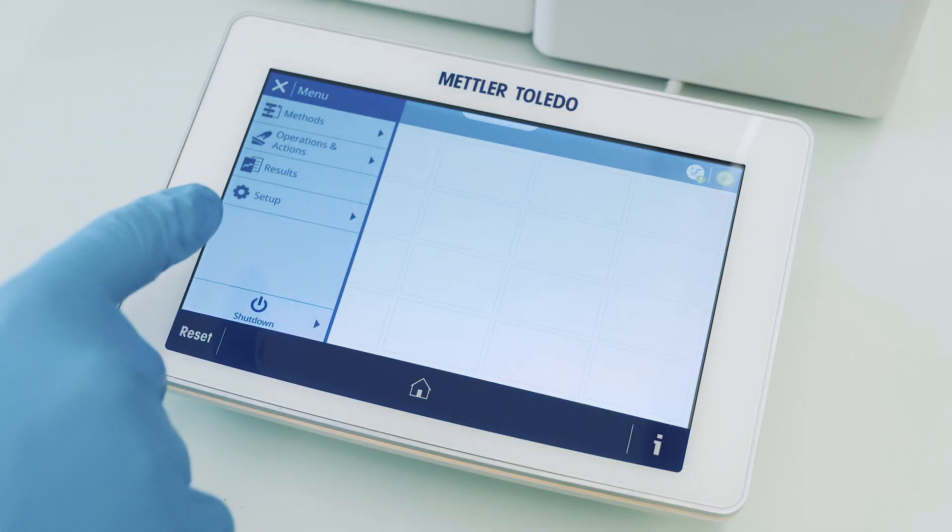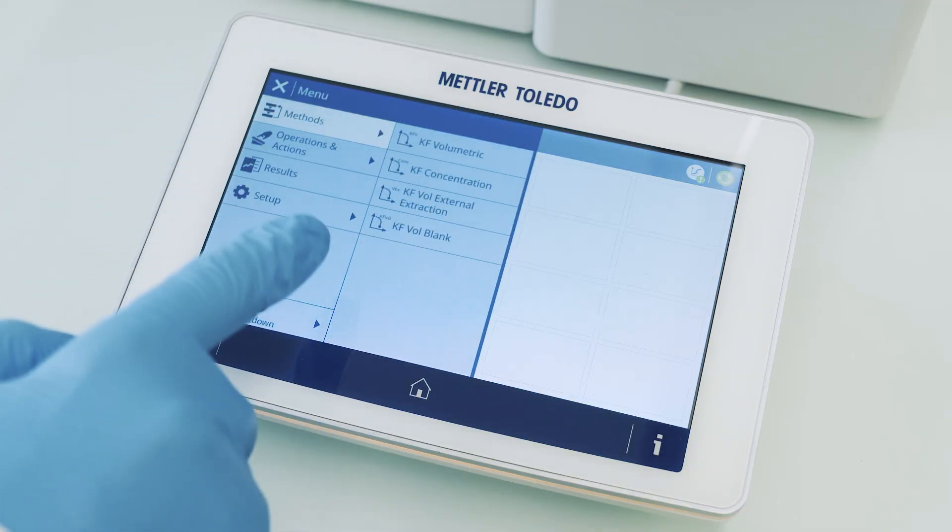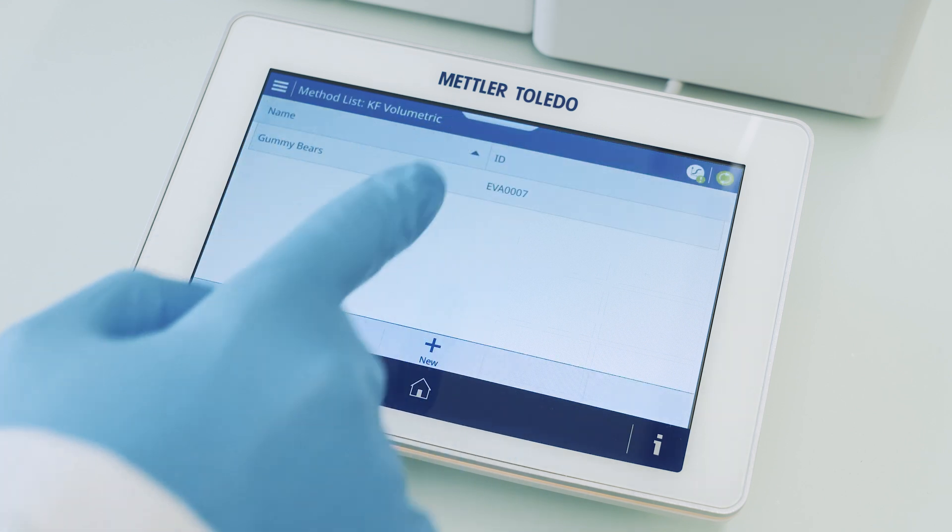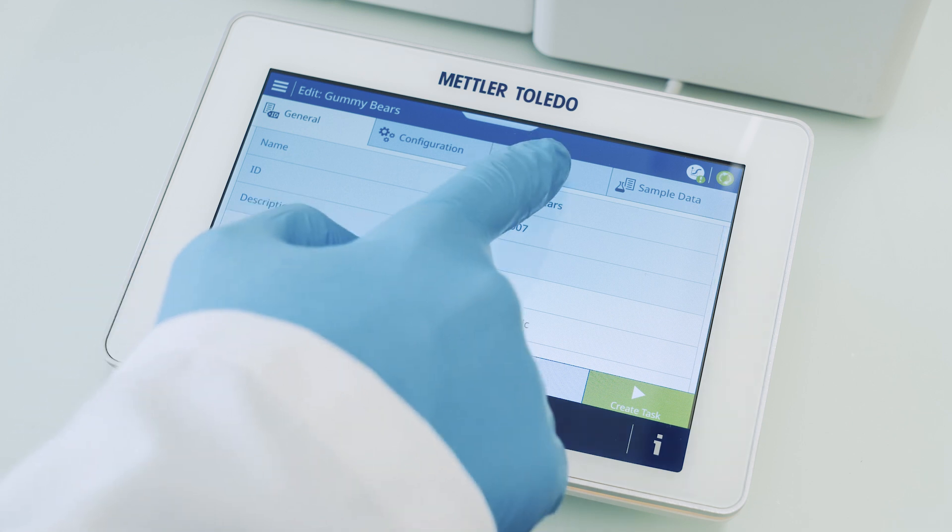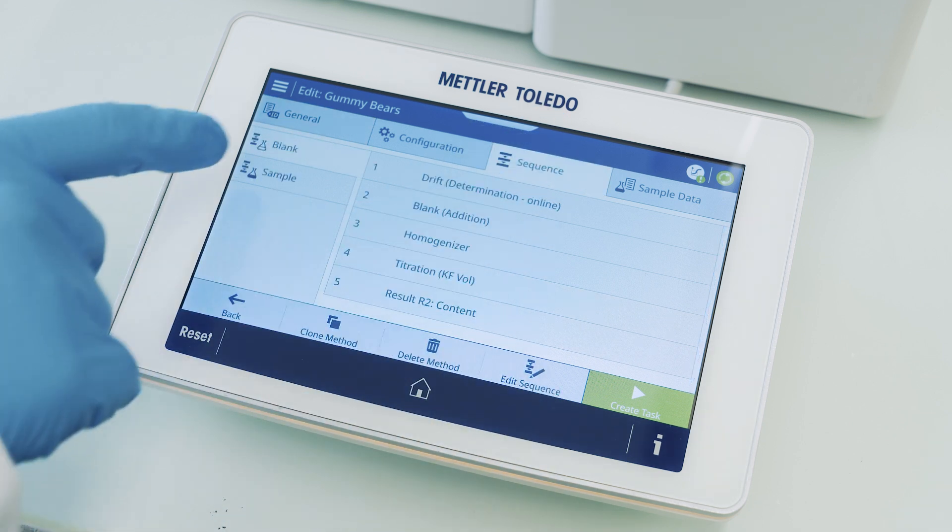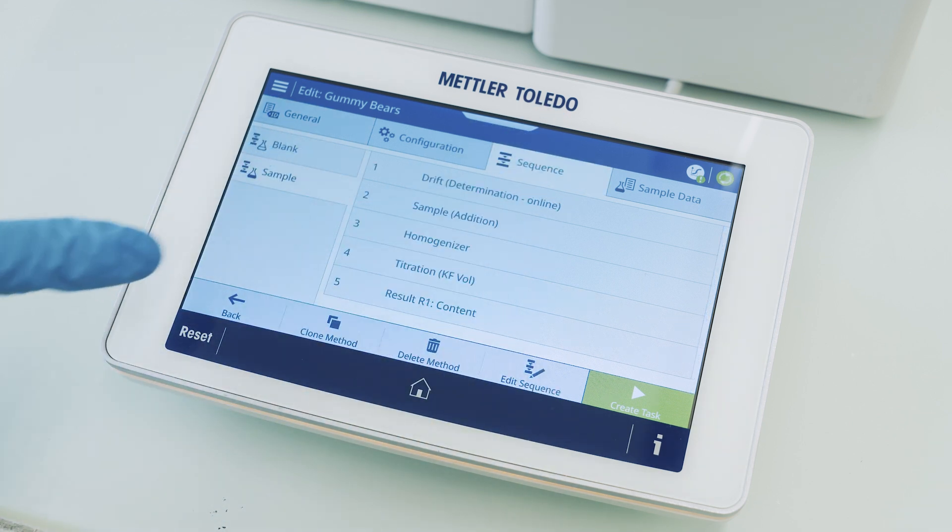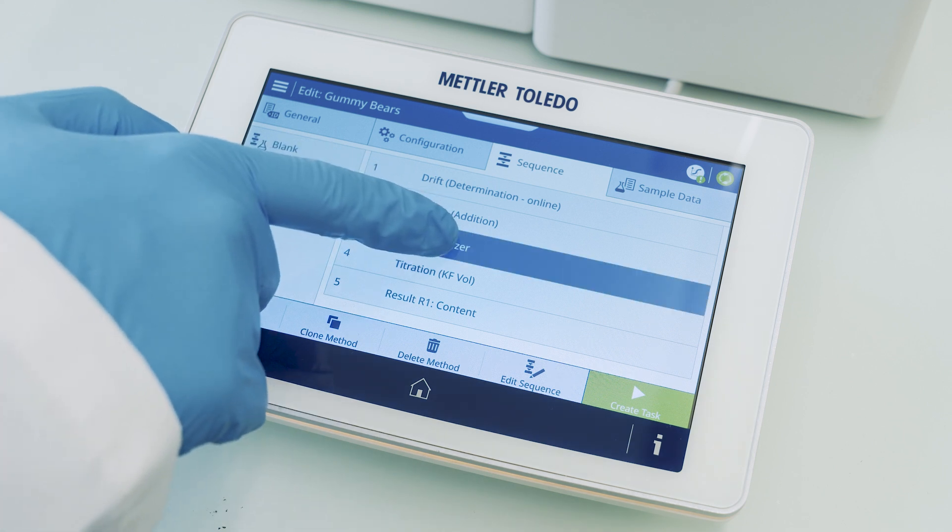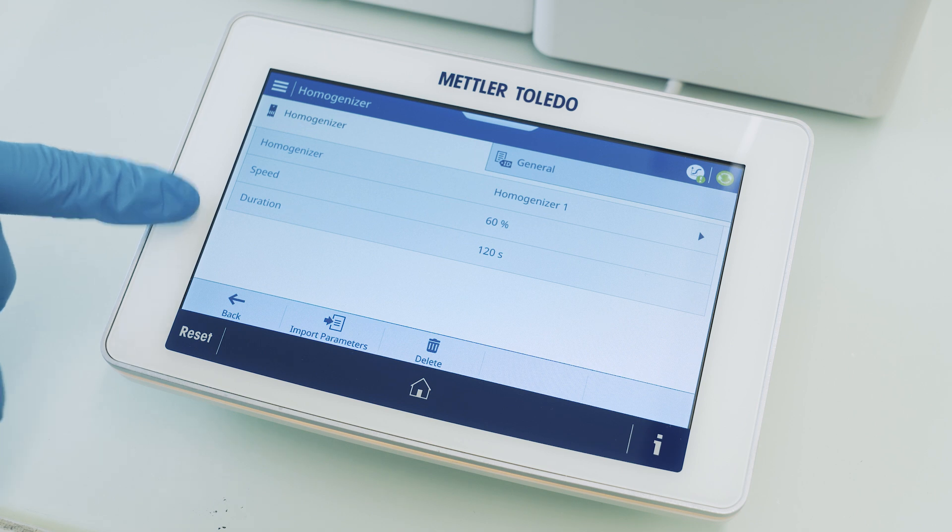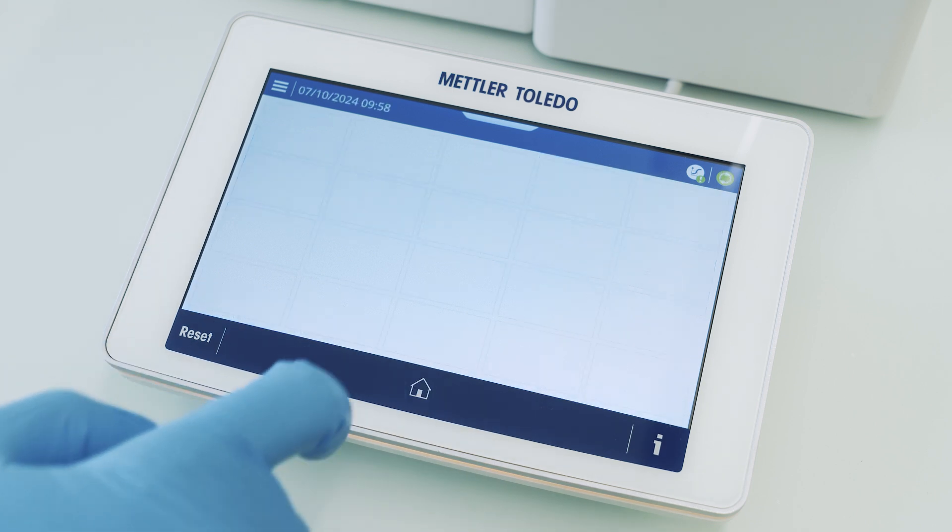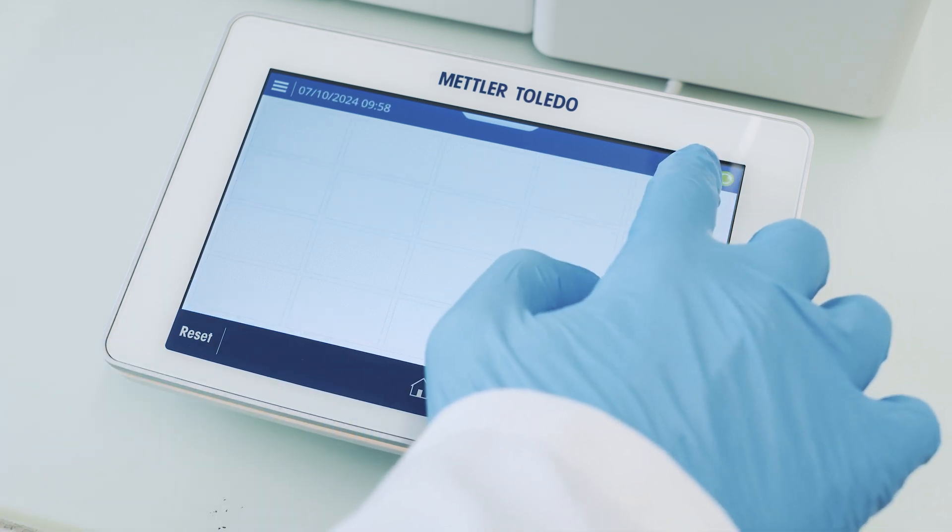If we navigate to the method, we can see in the method sequence there is a method function called homogenizer. In this method function we have a speed and the duration which turns on the homogenizer for this certain amount at this speed.